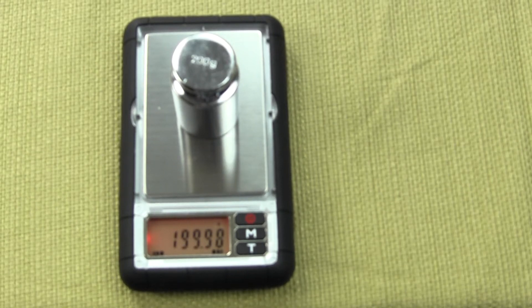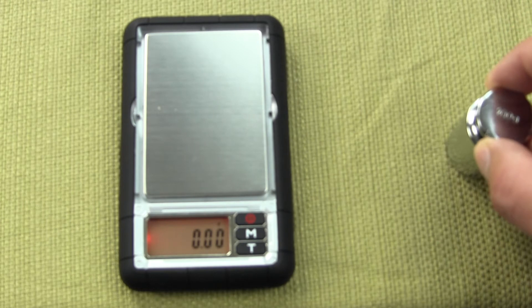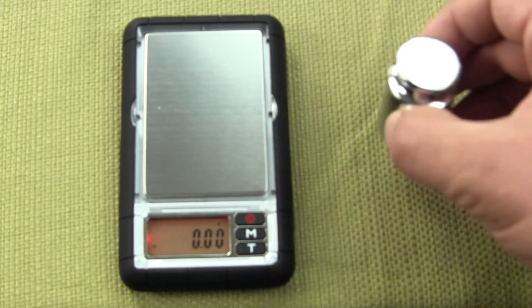In this video, we're going to show you how to calibrate a DuraScale D2 300 gram capacity scale. Calibration is simple. It does require you to have your own 200 gram calibration weight.